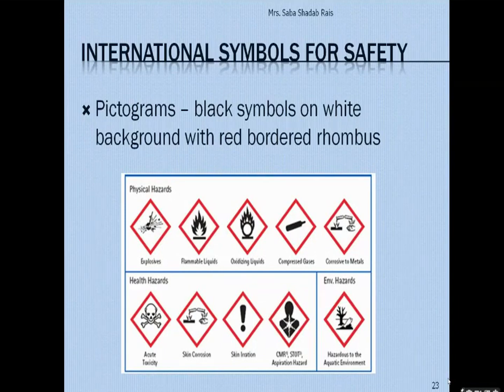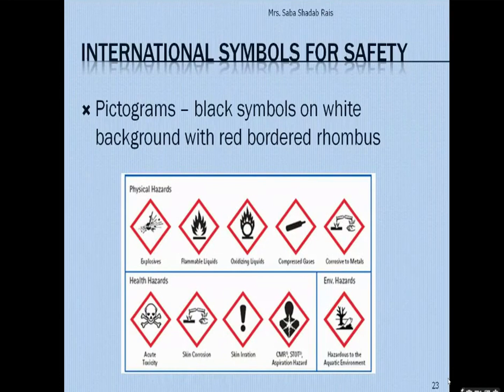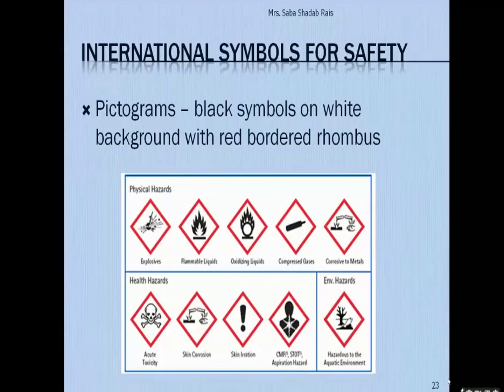It is not just that I am teaching you the safety symbols; you must make it into practice. Whatever safety symbols are taught to you, you must observe on the bottle and understand, because with each pictogram I am going to explain how you are going to handle it. Hence it is strongly recommended to be completely oriented about the safety symbols, their meaning, the hazards related to them, and all necessary precautionary measures to be followed while working in the laboratory.